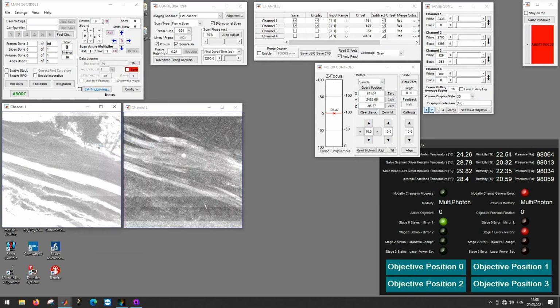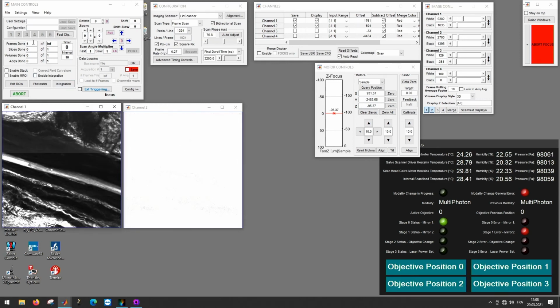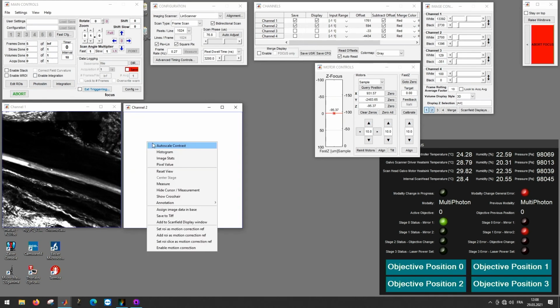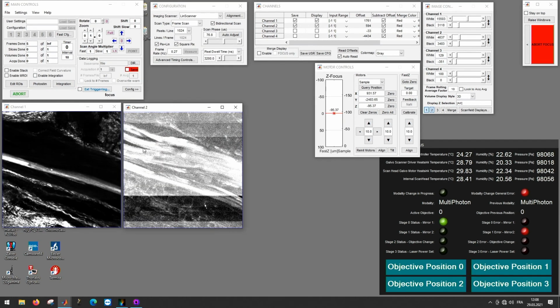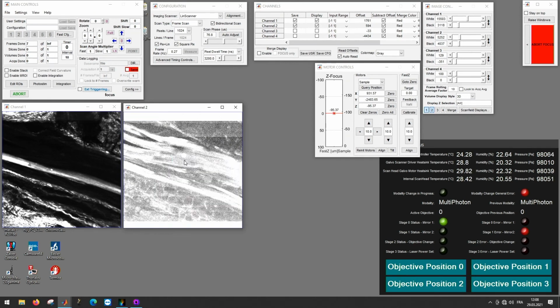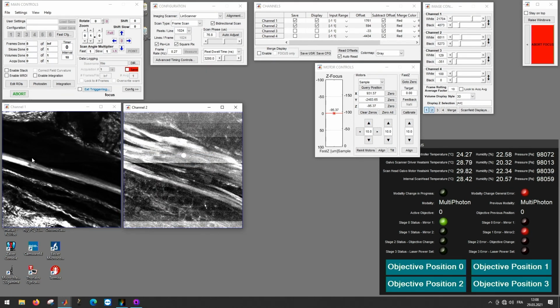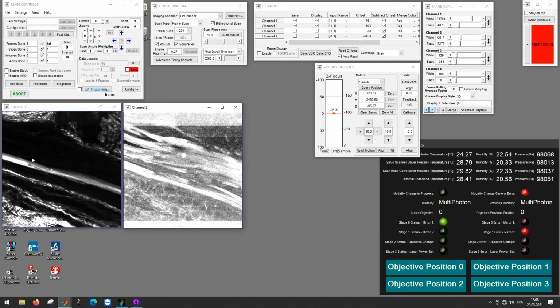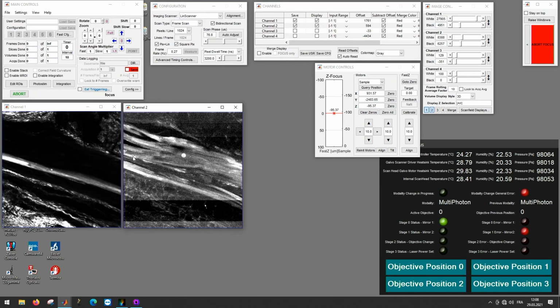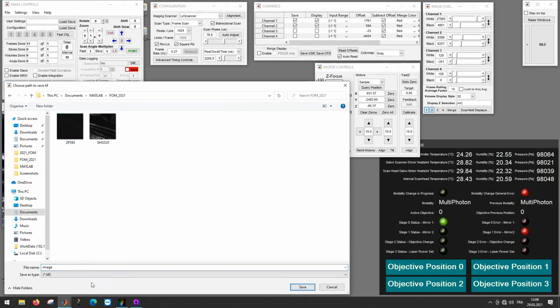You can see the structures more properly. And here you can see the amount. It's 4 images right now. Just do the auto scale so that we can view the live mode. And 7. Another 2 images to go. And the last one. Okay, and then we can abort the imaging process, and I will also save these images.